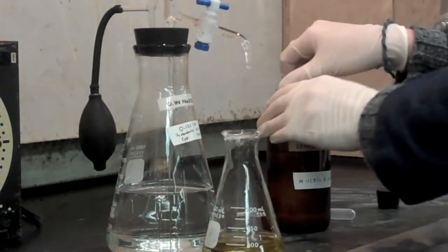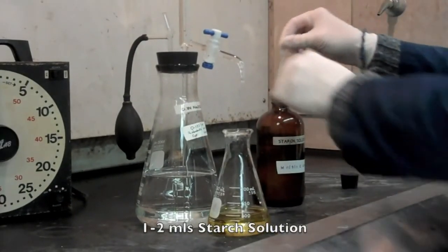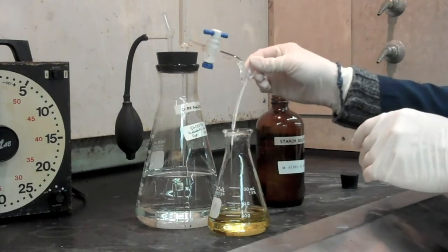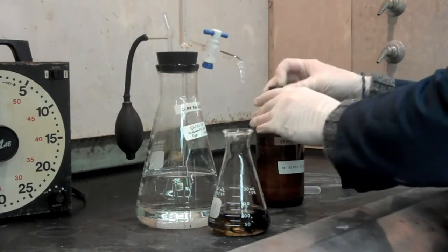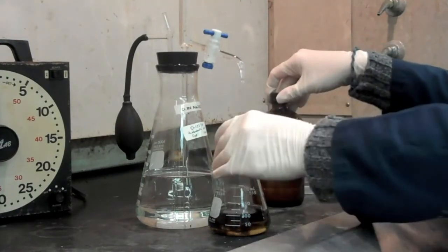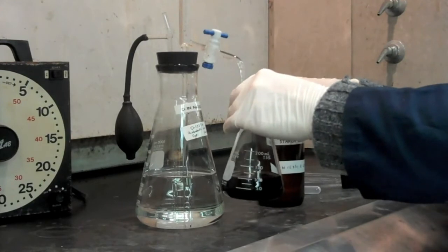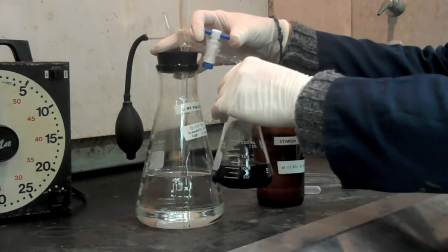For the second part of this titration, we are going to add 1 to 2 mils of 1% starch solution, and in the presence of iodine, the starch iodine will form a dark blue color, and this is our indicator. So we're now going to continue the titration. We're not going to re-zero the burette, and now we're going to go dropwise until this dark blue color disappears.